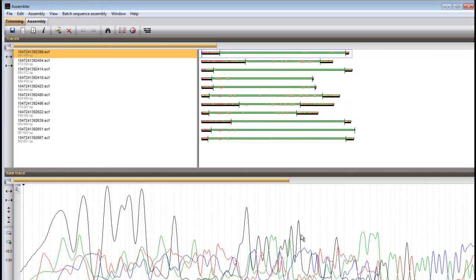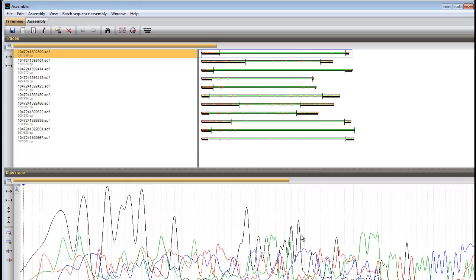The upper right panel gives a graphical overview of each partial sequence, showing a color code for the quality of the densitometric curve. Green stands for high quality, ranging over yellow and orange towards red, which stands for low quality.